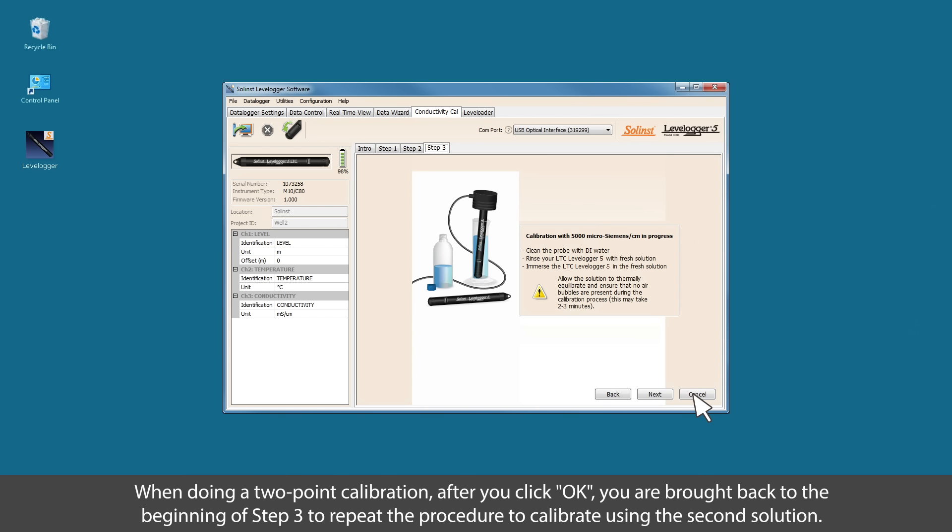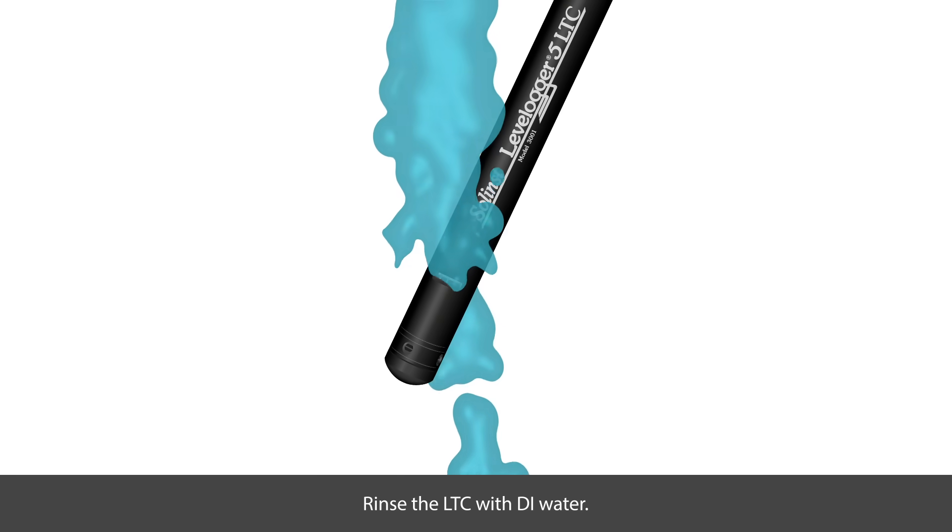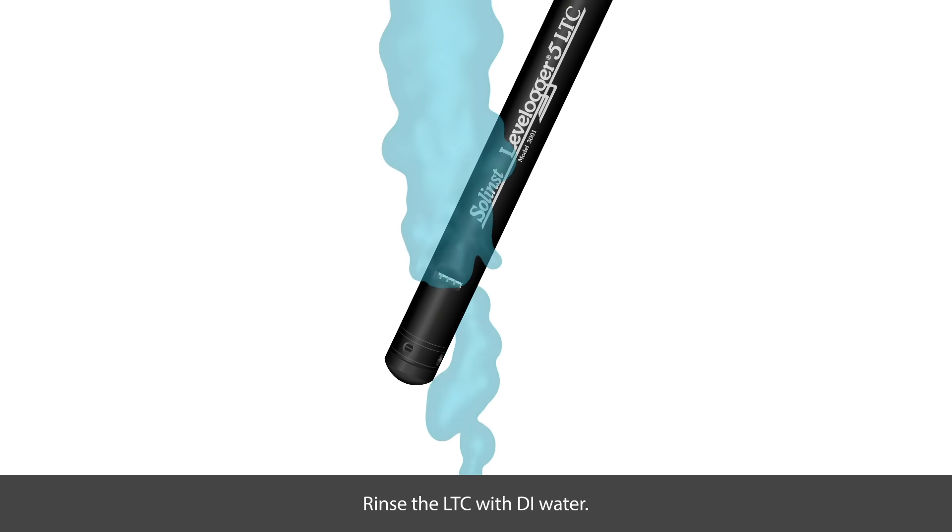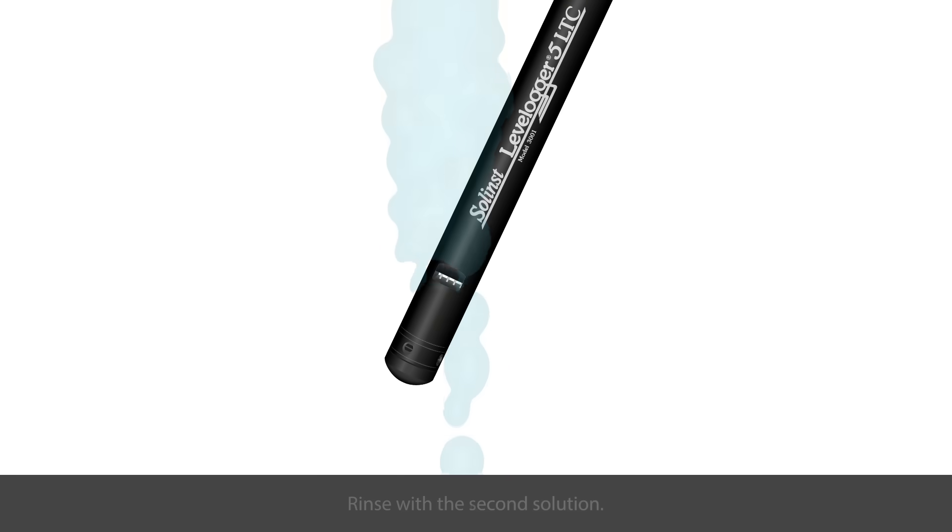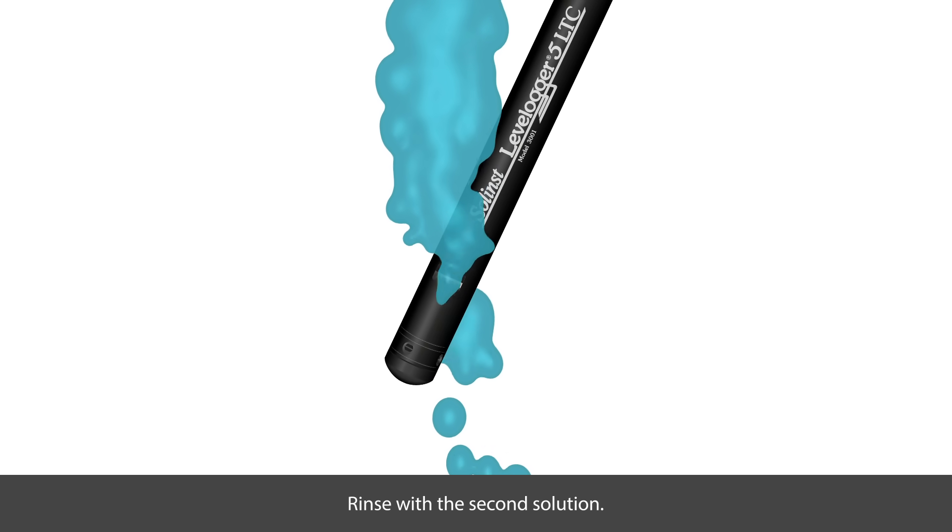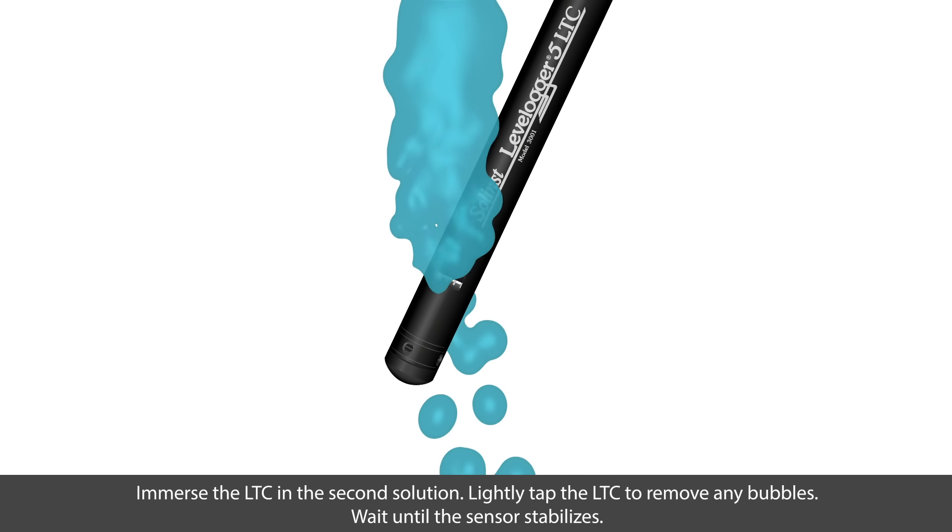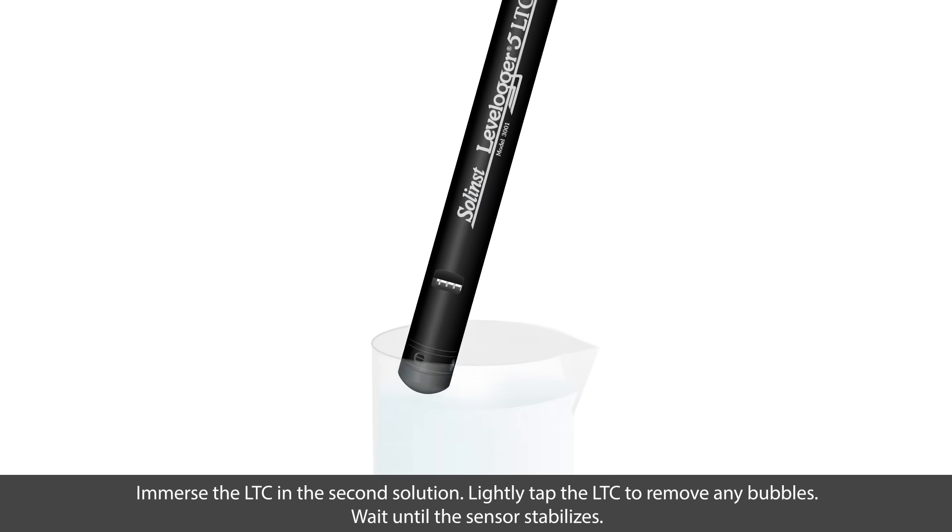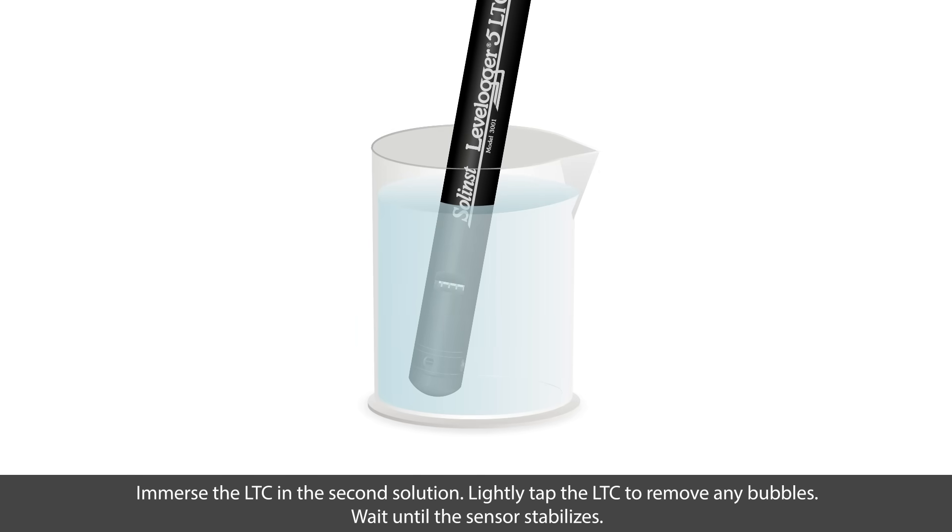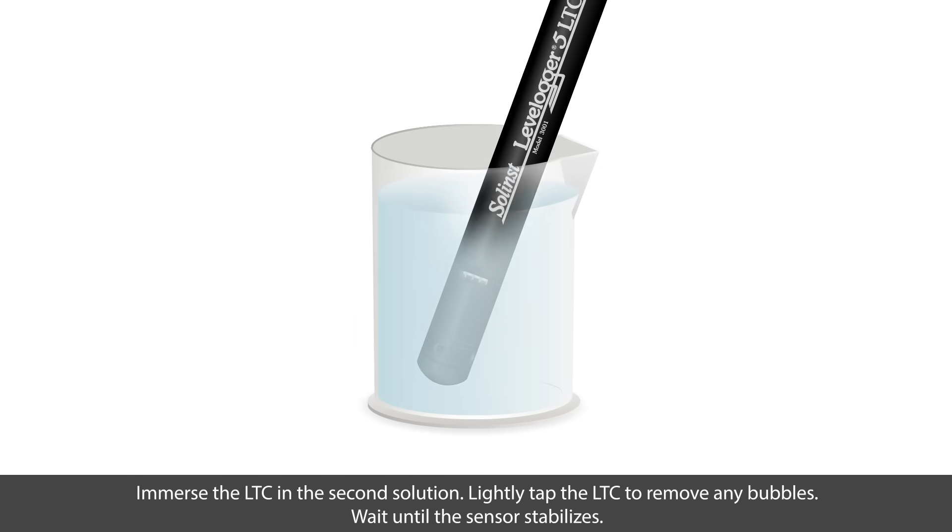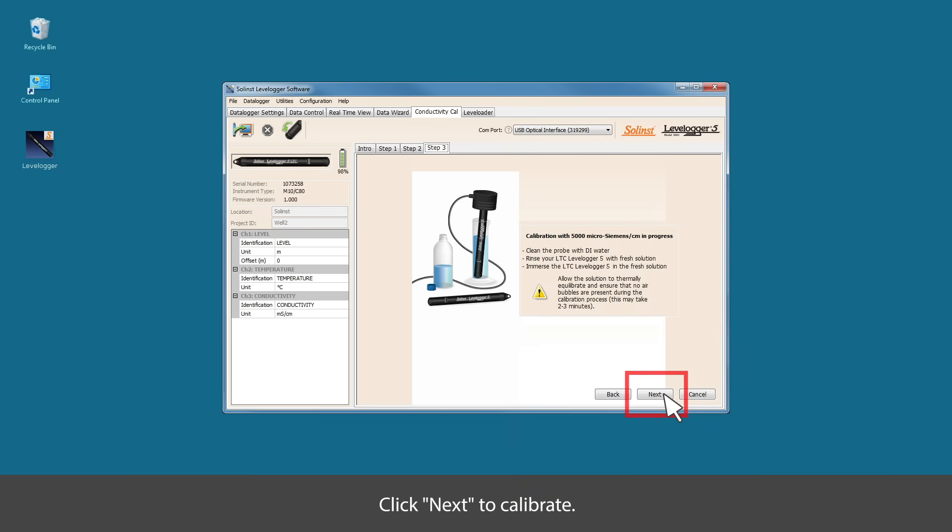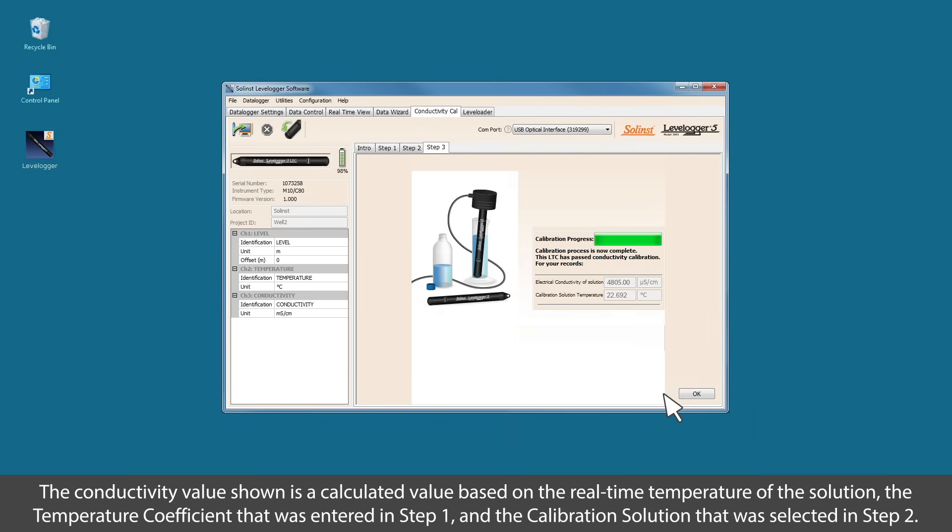When doing a two-point calibration, after you click OK, you are brought back to the beginning of step three to repeat the procedure to calibrate using the second solution. Rinse the LTC with deionized water. Rinse with the second calibration solution. Then immerse the LTC in the second calibration solution. Lightly tap the LTC to remove any bubbles and wait until the sensor stabilizes. Click next to calibrate.